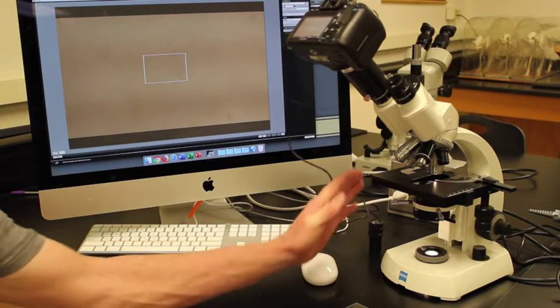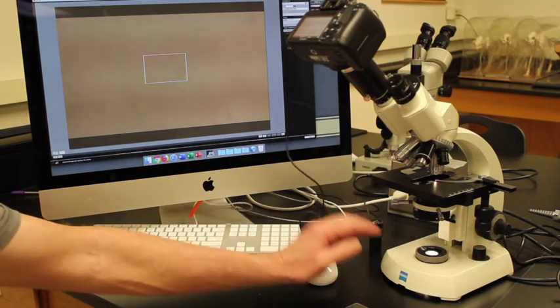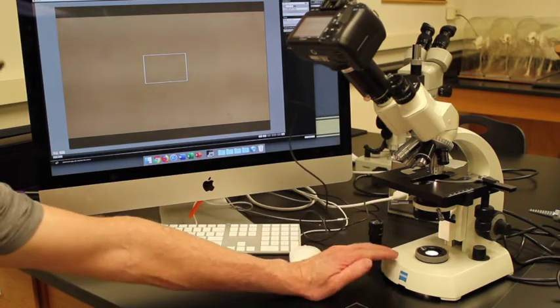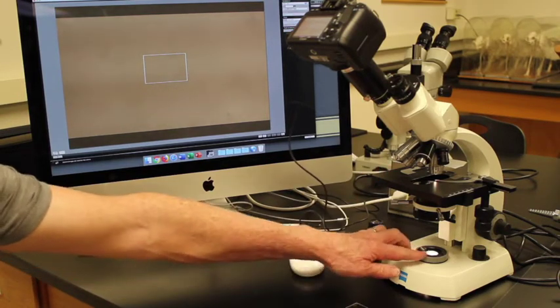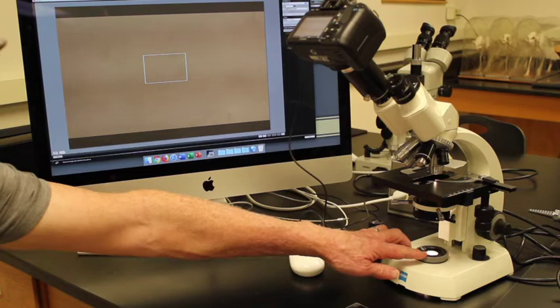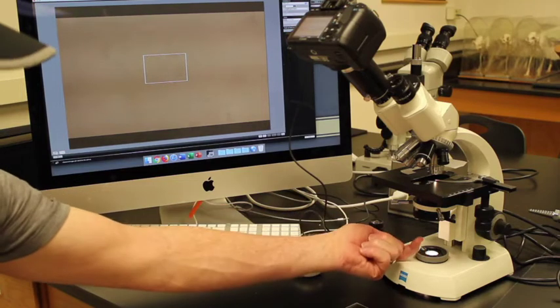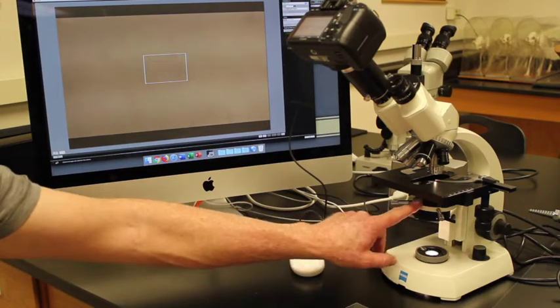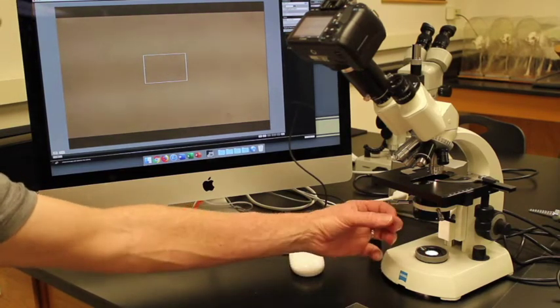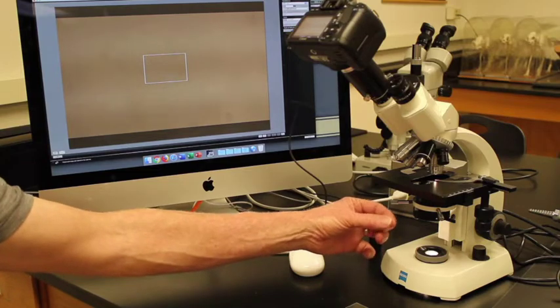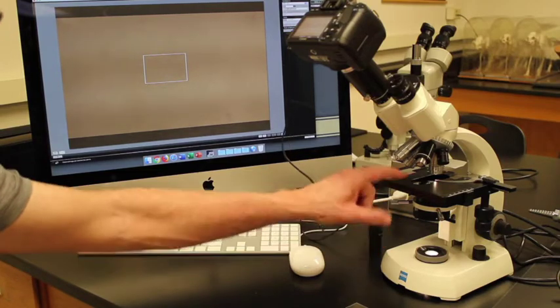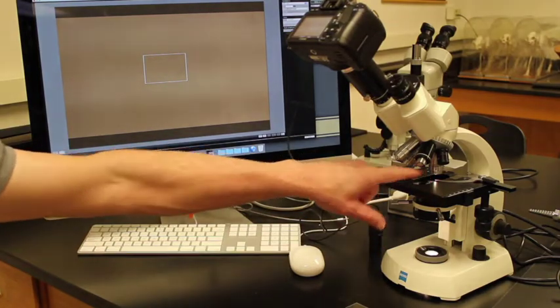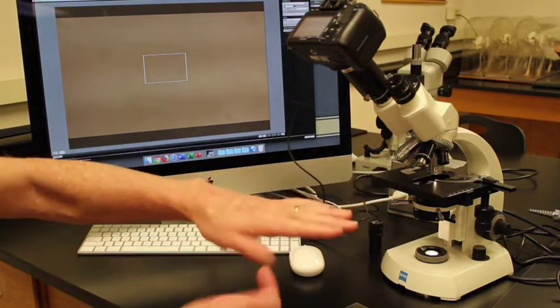This is the microscope we'll be using. This is a brightfield microscope. Brightfield microscopes begin at the bottom with a light source. The light source shines light up through the substage. There's a condenser that basically focuses light. The light passes through an object then goes directly through.